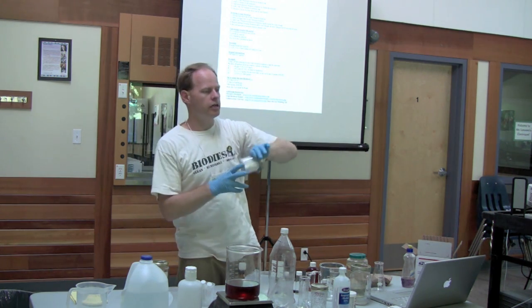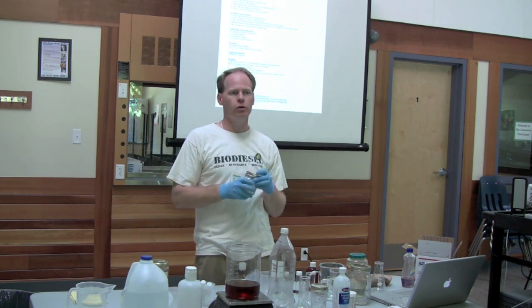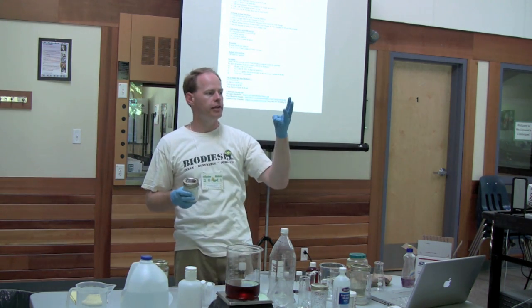So what we're going to do is something called a titration, and a titration is nothing more than counting the fingers that have fallen off the hands in the oil.